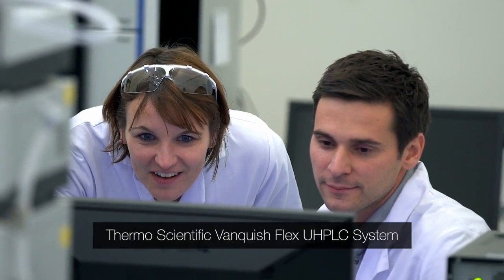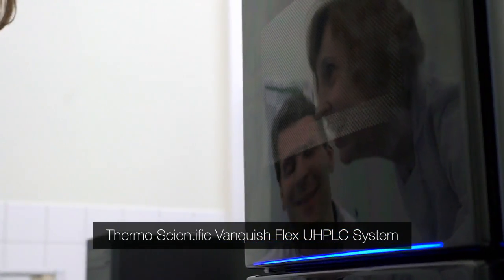So usually when you think of a UHPLC system, you have a pump, an auto-sampler, a column compartment, and a detector. With the Vanquish Flex we have the same, but it doesn't look anymore like we have modules — it's one big thing. My favorite feature is the sample pre-compression.